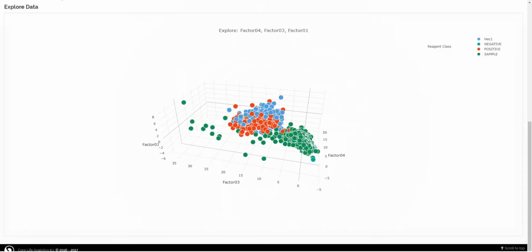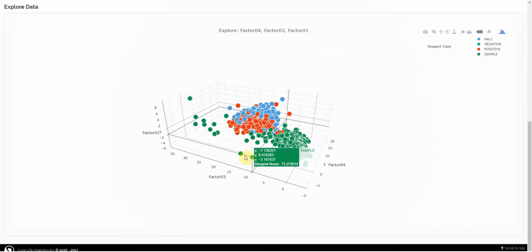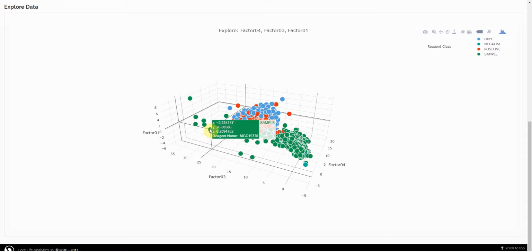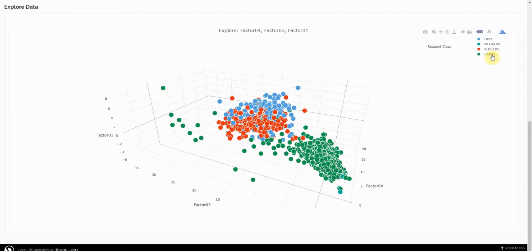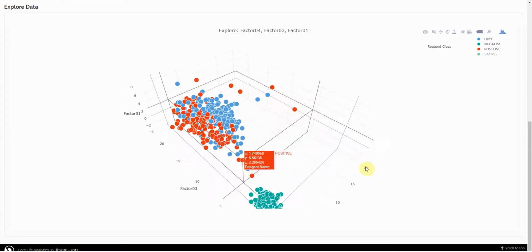As you may remember, I've been adding various interactive technologies to our HC StratoMineR data analytics platform. This is an example that I showed you before of a nice interactive 3D plot that we've been using. And we're putting all of these interactive technologies in a package that we call visual data mining. So you can see here how it makes it a lot easier to interact with your data. You can get a lot of insights out of this.